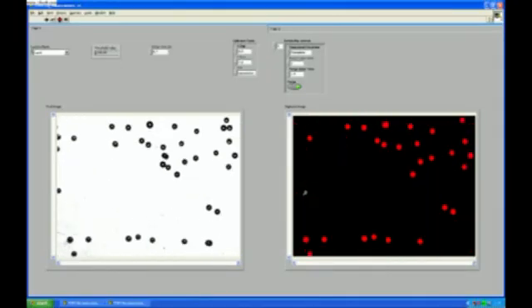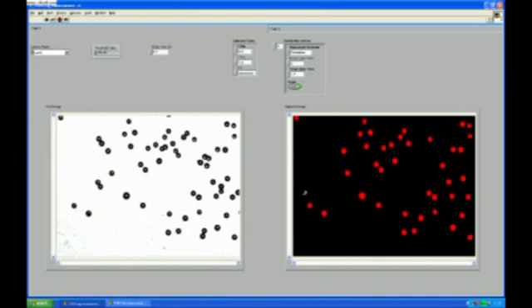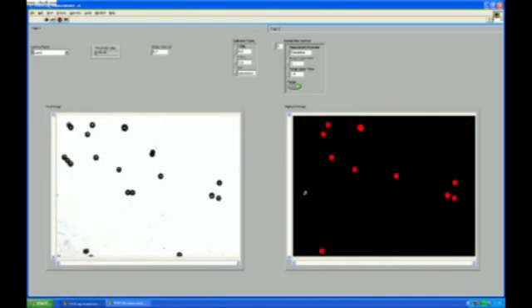We also have an image analysis system where the image is on the left, the digitized image on the right. And it's possible then to have a look at the size distributions.